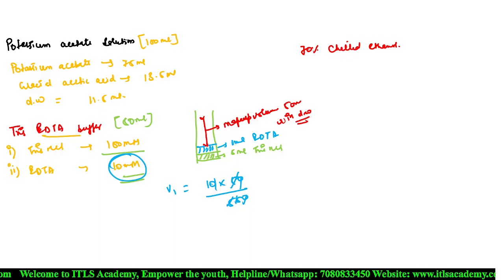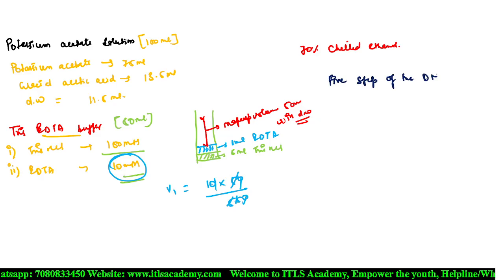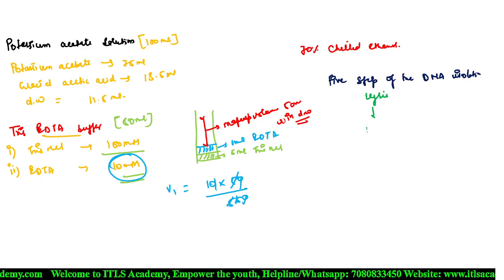Now, when we start our procedure, it is completed in 5 steps. Now, step 3, DNA isolation. The first one is your lysis, then purification.